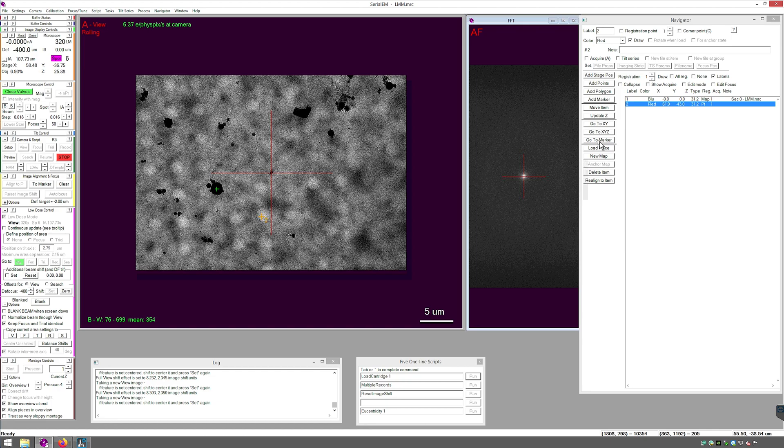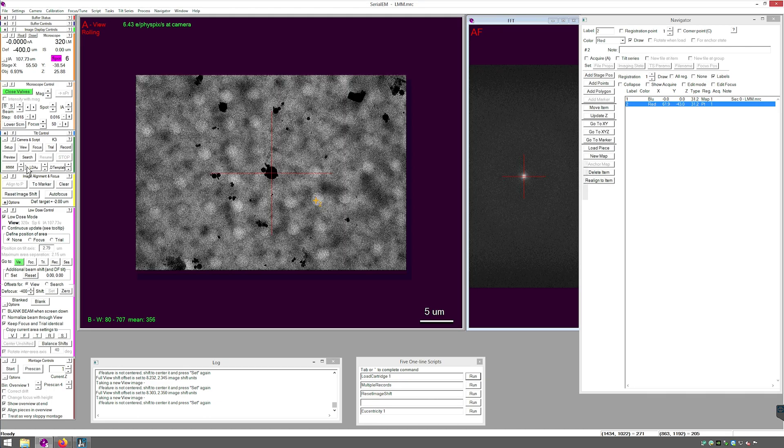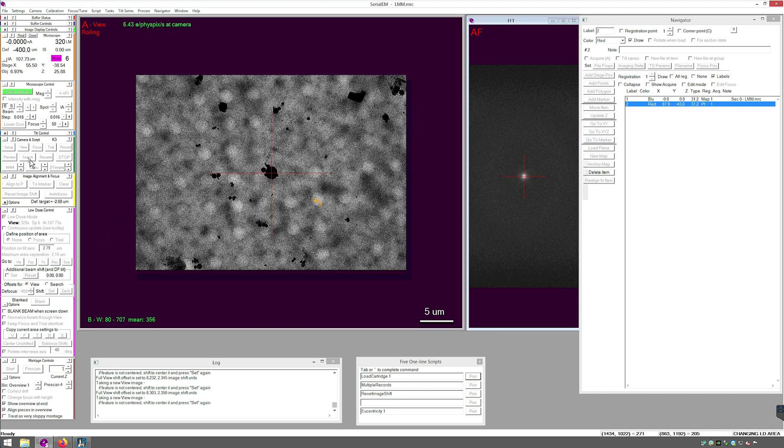Let's see if this will work. So now view. That is accurately centered. Now I'll take a search image.